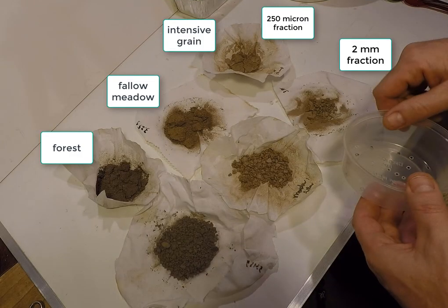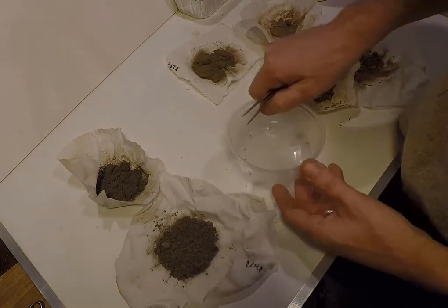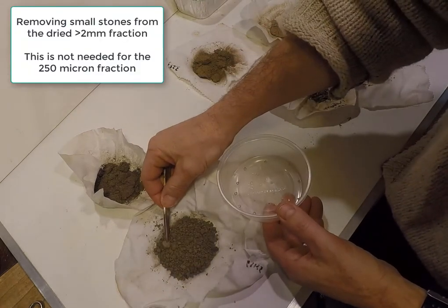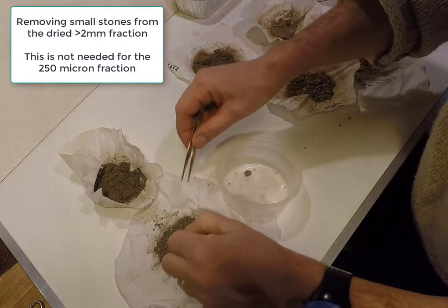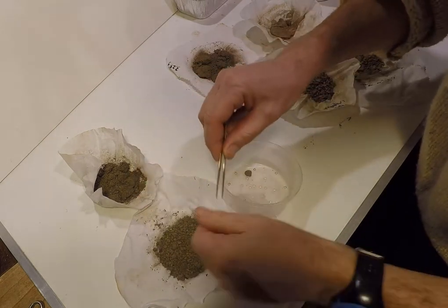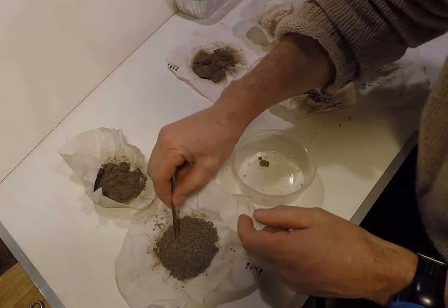Here we visually compare the different soils and land use management options with the different fractions. After drying in a drying oven or other dry, warm place, small stones can either be picked out by hand or sieved out of the larger 2 mm aggregate fraction.